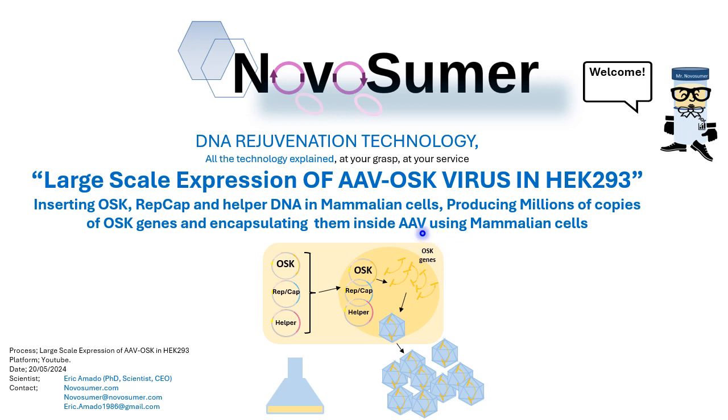Okay, let's have a look here. We have the mammalian cell here, and what we are going to do is co-transfect. That means include the three DNAs inside the mammalian cells. The OSK DNA, the RepCap DNA, and the helper DNA.